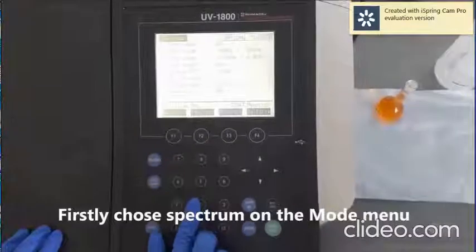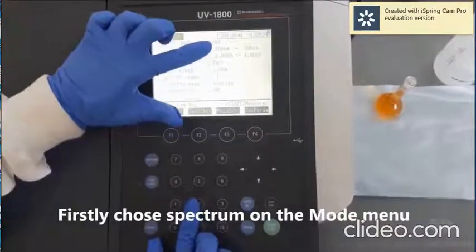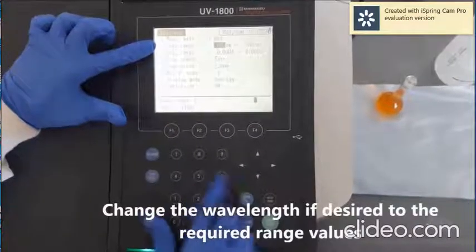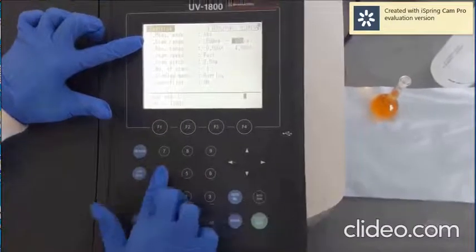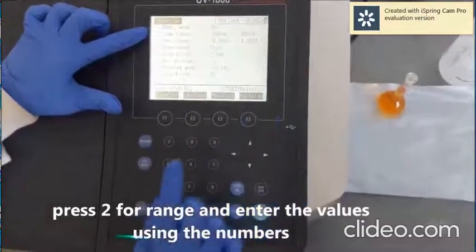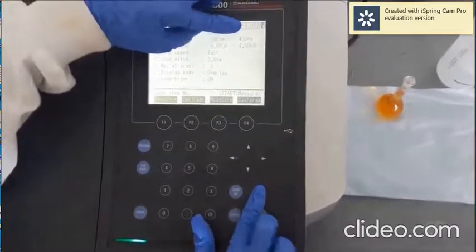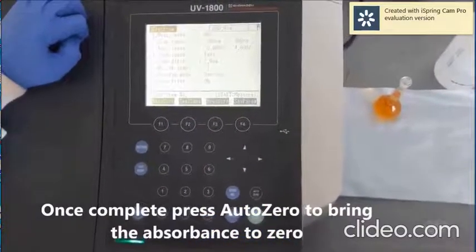Then press 2 for the range, enter the value, set auto 0 to have the absorbance at auto 0. Now press F1 for baseline correction. That is it. The machine is ready. Now we can go for further analysis of the samples one by one.